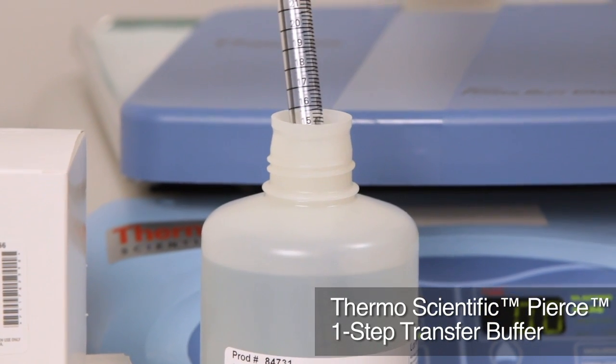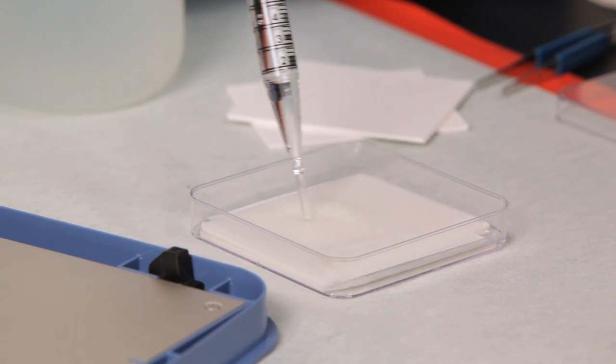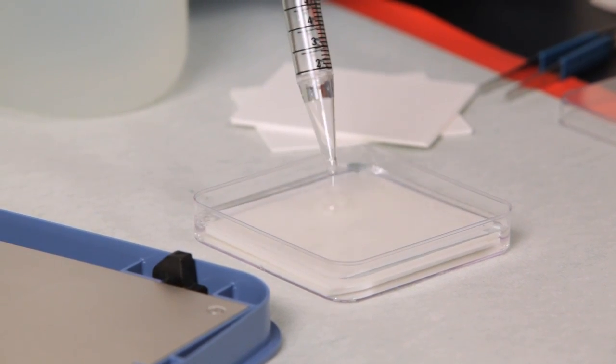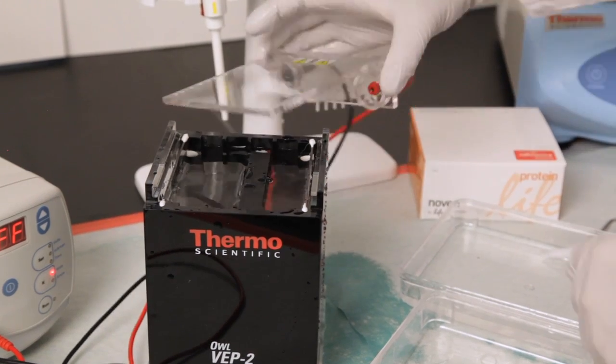Rapid transfers are performed using the Pierce One-Step Transfer Buffer, which allows a higher current to flow through the transfer stack than traditional buffers, such as Tobin Buffer, that are used for more time-consuming transfer methods.